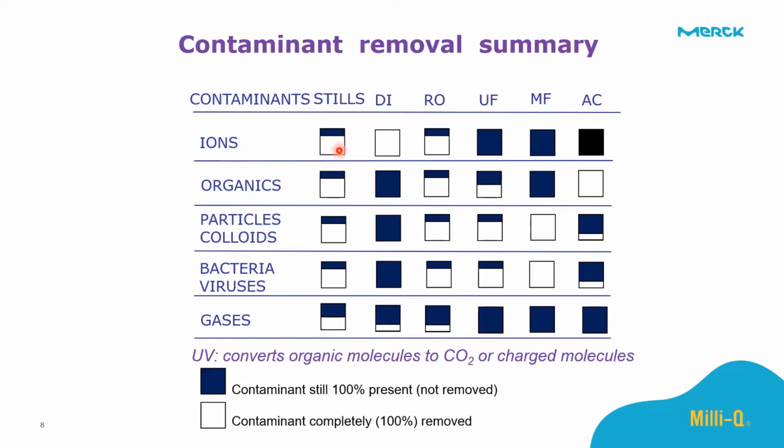So if it comes to ions, you'll still have some ions in the water. Organics, you still have some. You still have some particles and colloids. Bacteria will be there, and dissolved gases as well. When it comes to deionization, it removes the ions completely, but has no effect on all these three and has very little effect on gases.